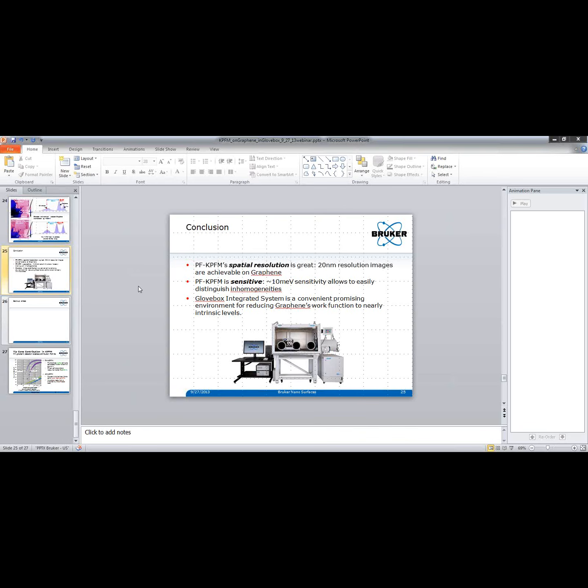Well, I think Aravind, you might better answer the first question. But the second question is that the glovebox removes both. You basically have a controlled argon atmosphere that always has less than approximately 1 part per million H2O and O2.